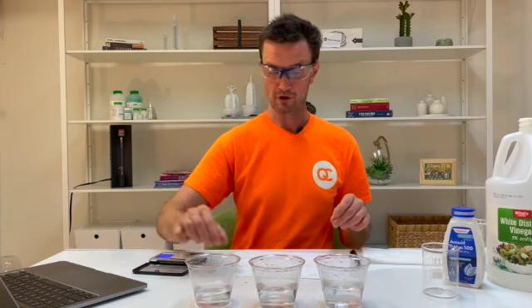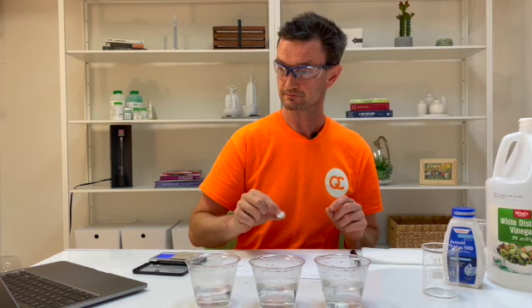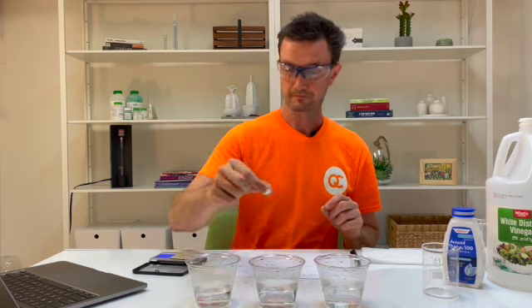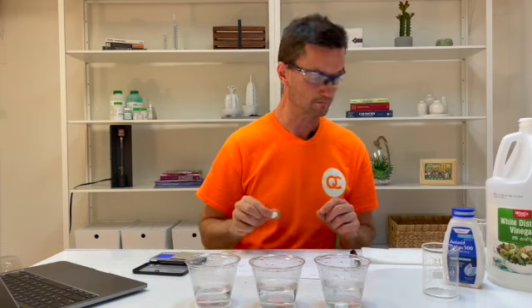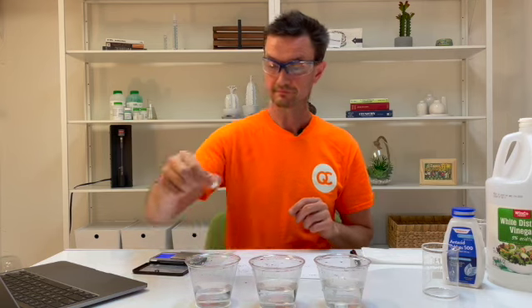Okay, so let me go to my stopwatch. Okay, ready? Bam. Okay, I'm going, and at that 10-second mark, I'm going to put this in cup number 2. Bam. And at the 20-second mark, I'm going to put this in cup number 3. Bam. Okay, we will run this for 2 minutes, and I'll be right back.